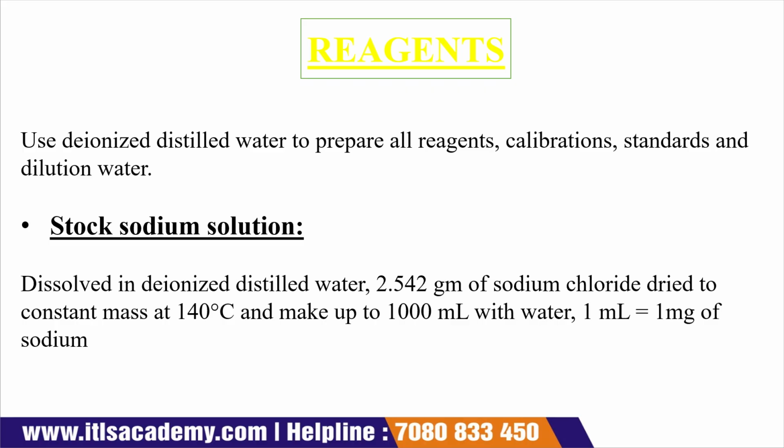Whether we are preparing the reagent, calibrating the pH meter, preparing the standard solution, or diluting with the help of water, in all the cases we should use deionized distilled water in the place of distilled water. So first of all, we have to prepare the stock of the sodium solution.